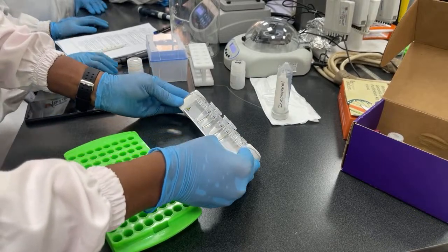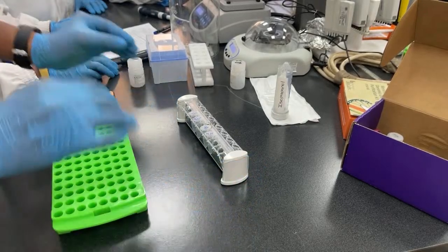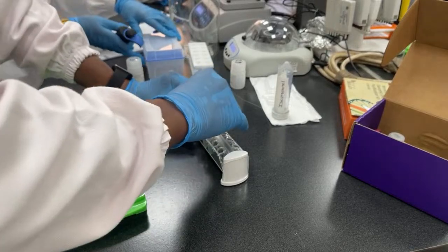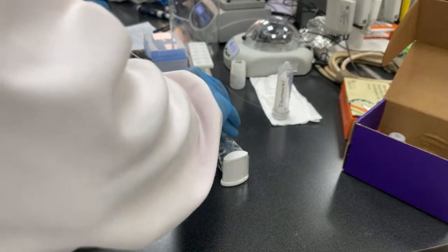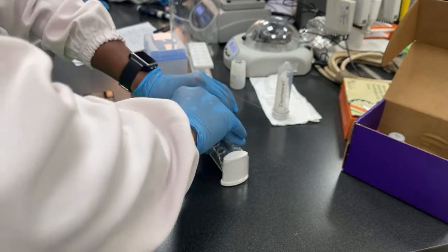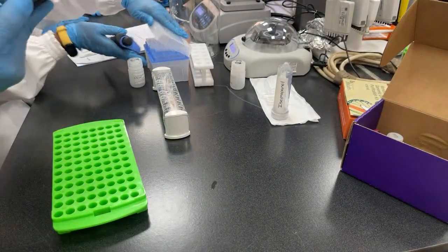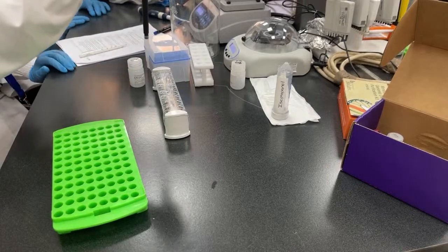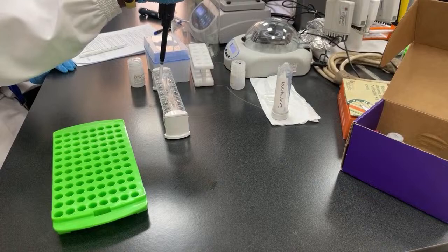Question. What are we doing here? On the mix, so we still repeat this step again. We do it once again, so it's like washing with CBD twice. Some reagents, so just wash it. They don't see the need of washing twice.